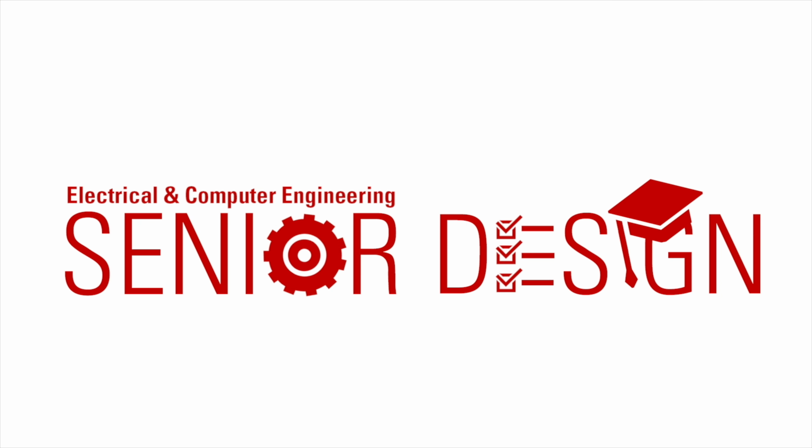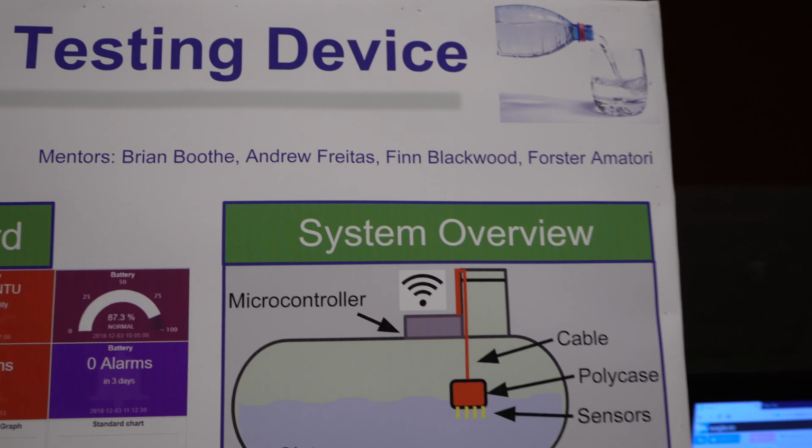Our project was to create a low-cost remote water quality testing device. The main idea was to create a device that can be deployed in a cistern, and it automatically samples the water, tests the water, and uploads the data it receives to the cloud. Then it'll notify the users or the homeowners whether their water may have become unsafe.